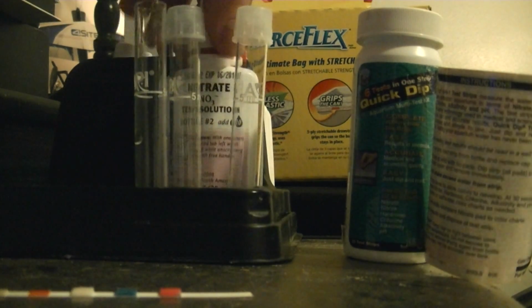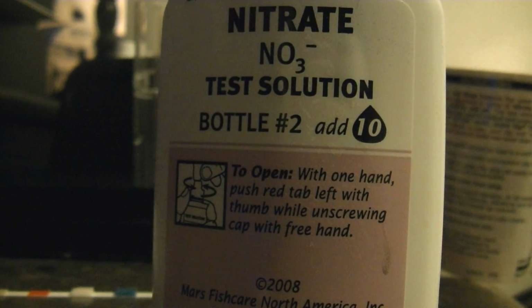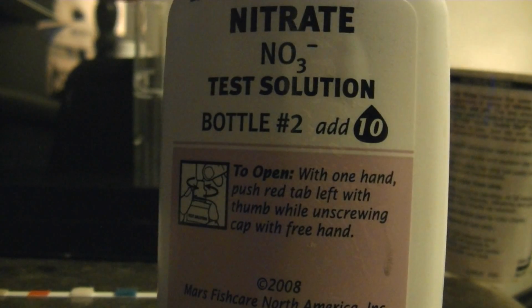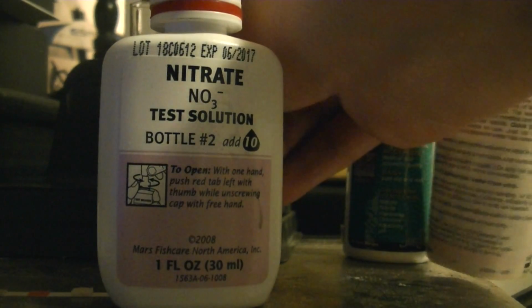While I'm shaking this test tube, for testing nitrates you have to use 2 bottles. You put in this and then you put in the second bottle. For some of the other tests you just use 1 bottle. So nitrate is actually one of the longest tests. Ammonia, nitrite, and some of the other things are quicker. But I'm going to shake them both up now. Test tube should be done. That's shaken up. And I'm going to remove the top from the test tube.